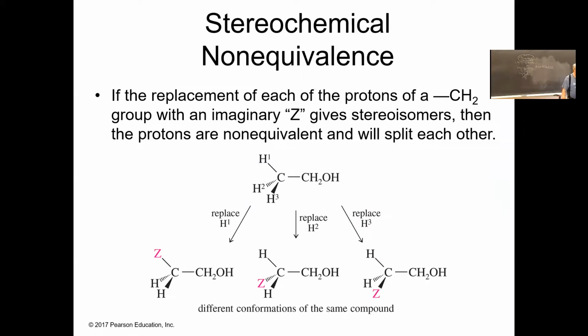We can also have splitting because of stereochemical non-equivalence. So here we have ethanol.